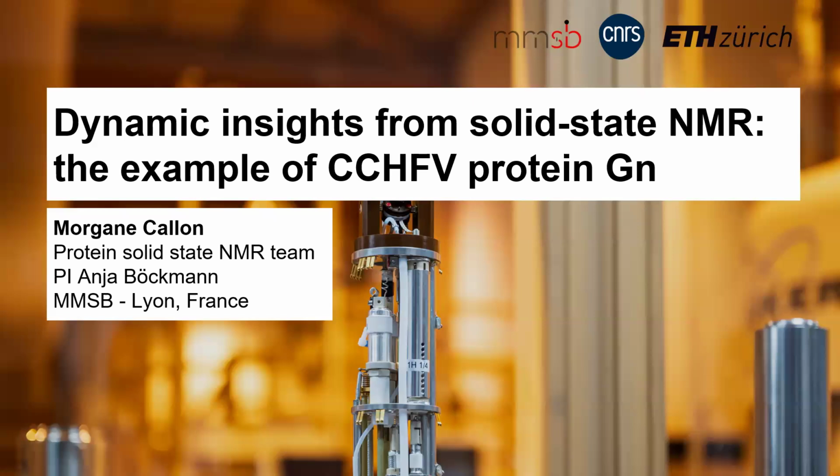Thank you very much. And also thank you to the organizers for the invitation here. So I'm Morgane Callon. I'm working in the protein solid state NMR team led by Anja Bockmann in Lyon. And we are using solid state NMR, and mainly fast magic angle spinning solid state NMR, to study viruses and viral proteins. And today I will show you information on dynamics from solid state NMR spectra using an empirical approach. And I will illustrate this with our recent study of the glycoprotein GN from a virus, the Crimean Congo hemorrhagic fever virus.